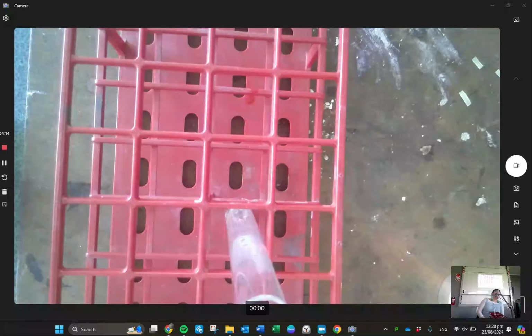That's the obvious one. So wait for it to react. Yeah, wait for it to react. Once the magnesium's gone, you're done. Oh, nice pop. All right.